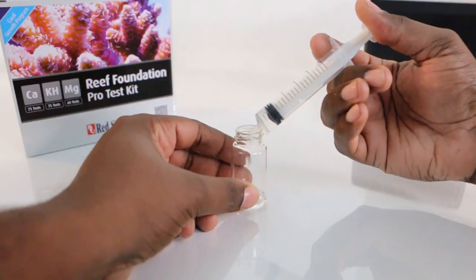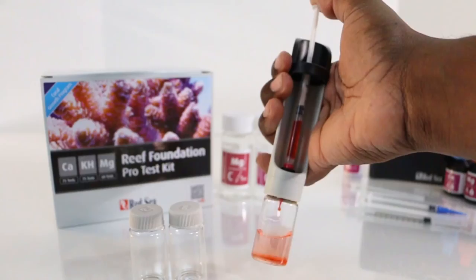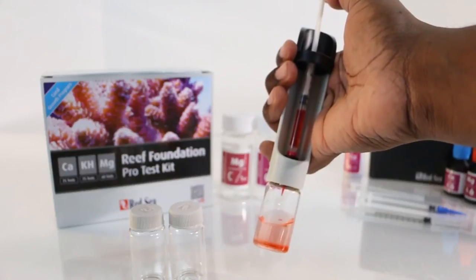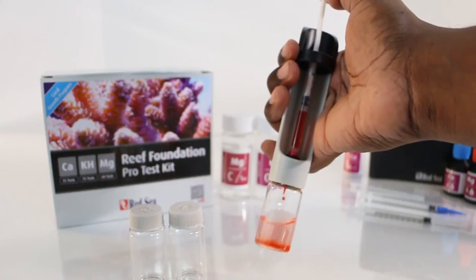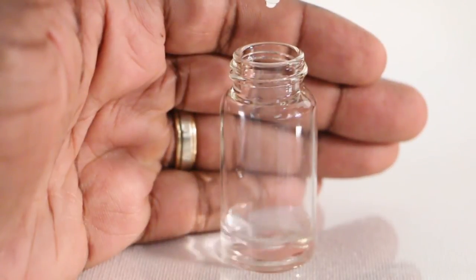The great thing about these test kits is that you don't have to be a rocket scientist to use them. Each test takes about five to six minutes to complete. The handheld titration units make it easy to accurately dose single drops. The glass vials are crystal clear so it will be easy for you to see your results.